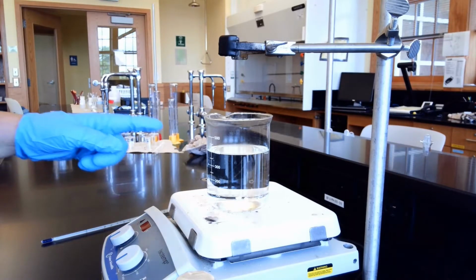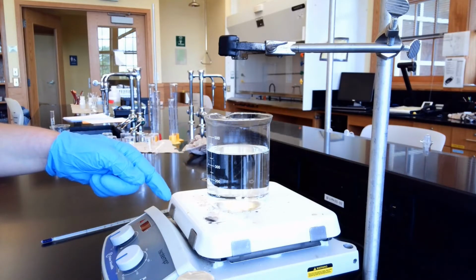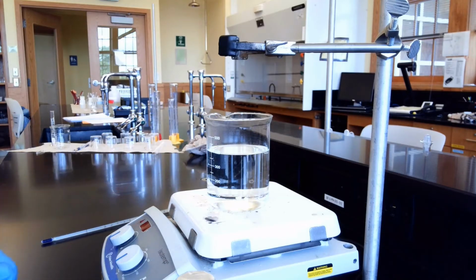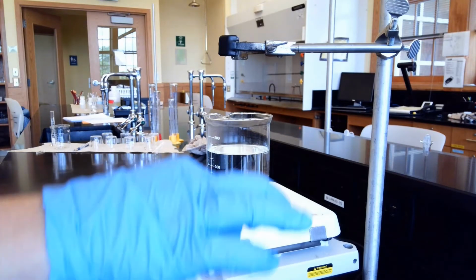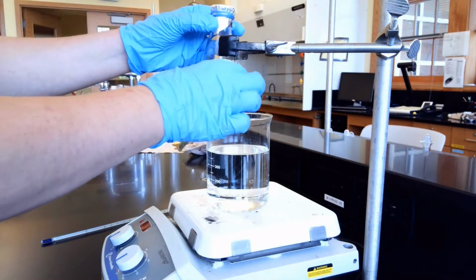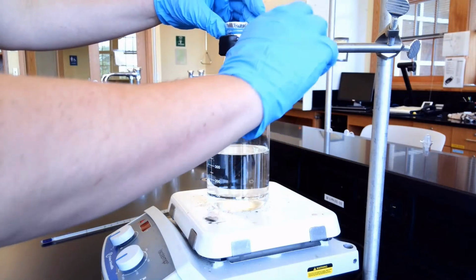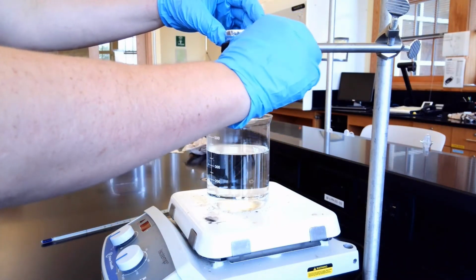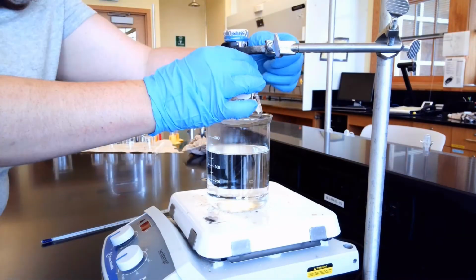We have our hot plate set up here with our water bath. We have some boiling chips in the bottom to make sure we're not going to superheat our water. And now we're going to attach our flask with our 5 mils of our unknown liquid in, and make sure it's secure.